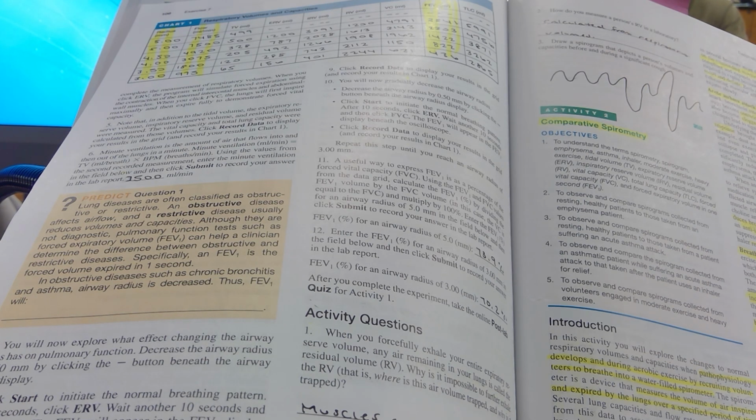Anyway, you're going to get some negative results, and remember I said that you have license to change your data so that you at least get numbers that are near what you should get. You can't have a negative lung volume. You can't have a negative lung capacity. That is nonsensical. So adjust it as necessary.